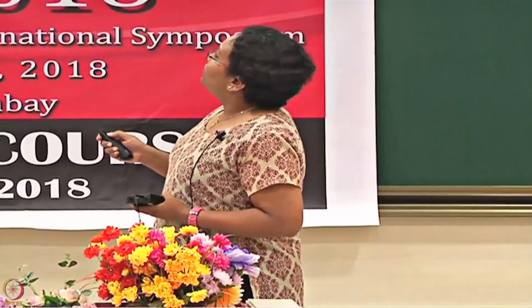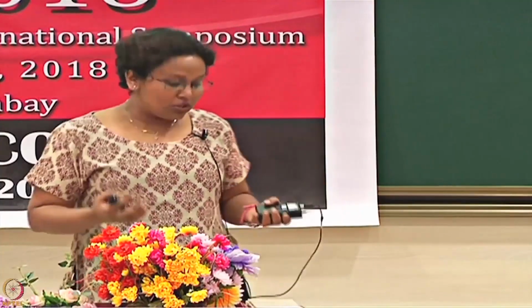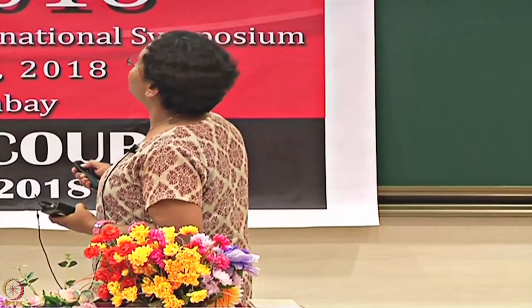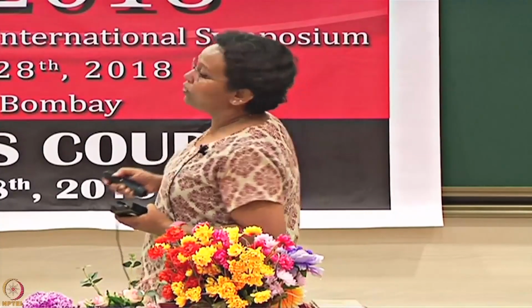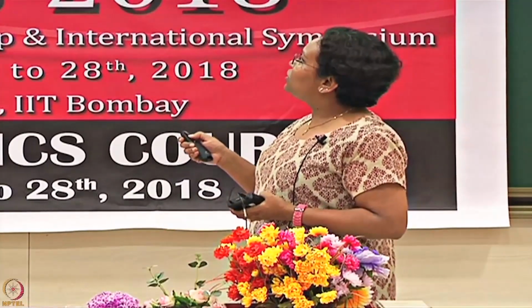Now this is what we call surface competition. The competition is happening at the surface. You have the analyte, and you attach or link your analyte with a competing analyte, in the sense a high molecular weight analog. The key is that when you attach the high molecular weight analog, its size should be considerably larger than your analyte.